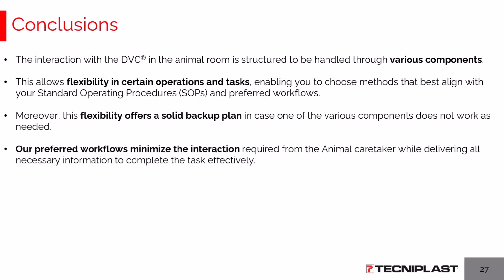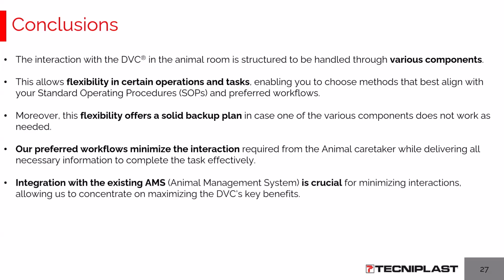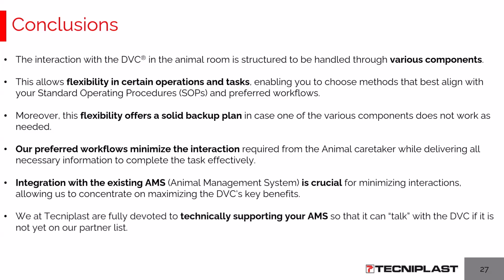Our shared and discussed preferred workflows try to minimize the interaction required from you while delivering whatever is necessary to complete the task effectively. If you have an animal management system, it would be crucial to integrate with it to minimize interaction. At Tecniplast, we already have a nice list of AMS partners we have integrated or are planning to integrate. But we are fully devoted to technically supporting this integration by directly talking with your AMS in case it is not part of our current list.